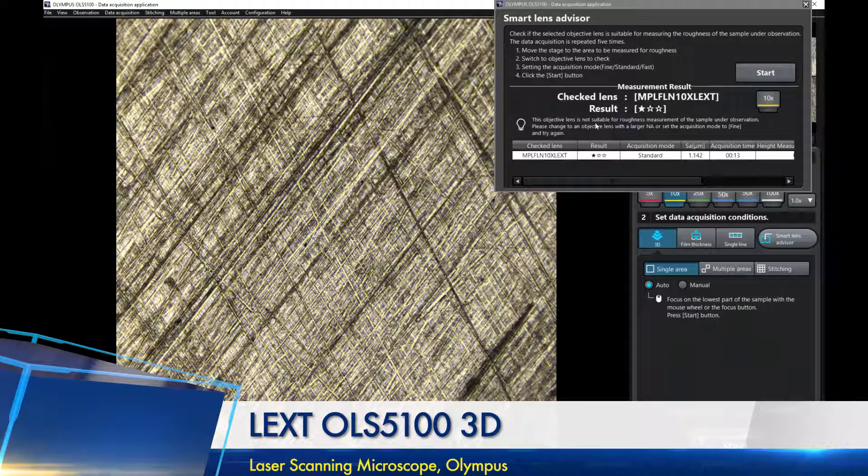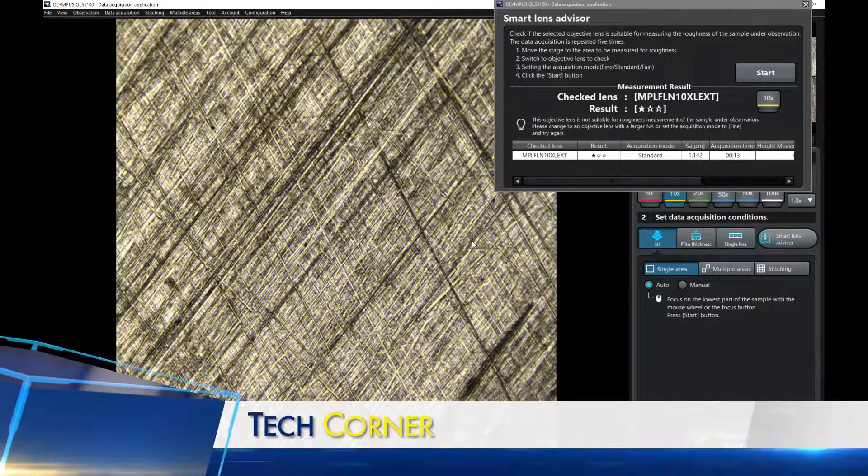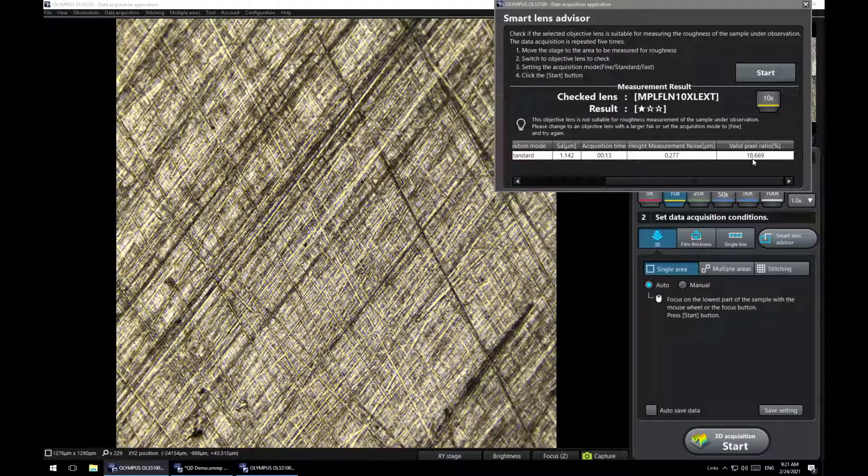After the scan is done, it gives us results with one to three stars. This objective has only one star — the surface finish of this sample is a little too fine for this lens to work well. Scrolling over, it shows how many valid pixels it captured, and it's a very low percentage. Up here it says: please change to an objective with a larger NA or resolution, meaning a higher magnification.